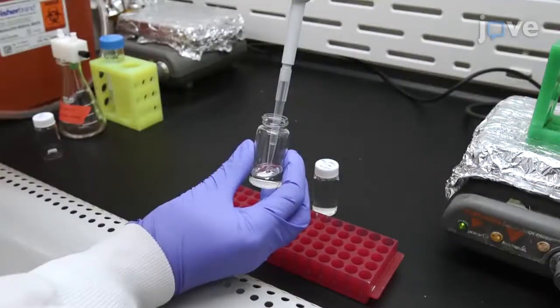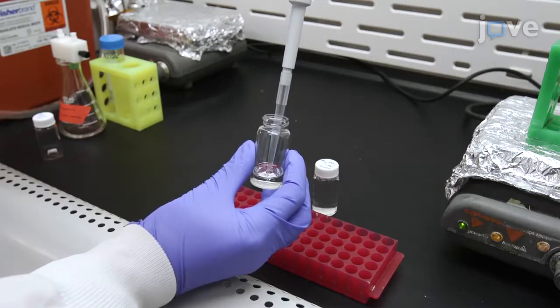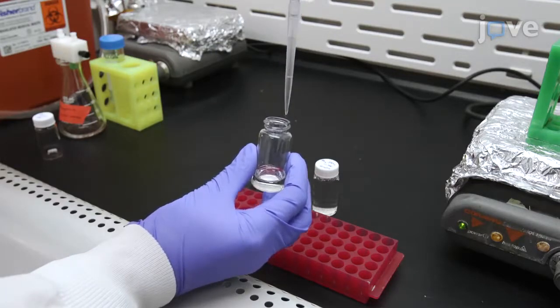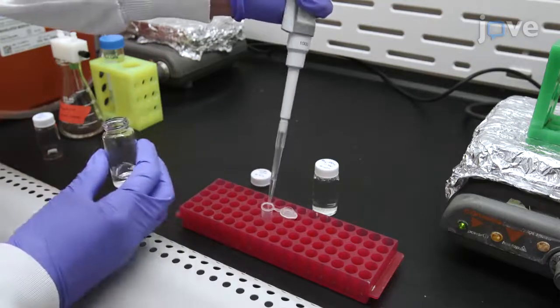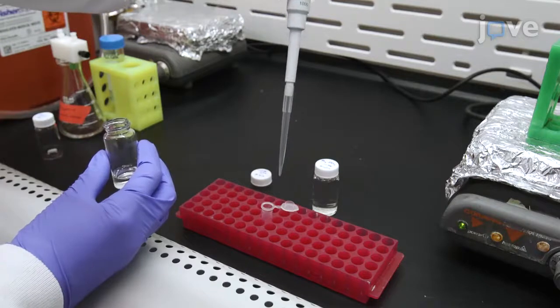Next, to begin preparing the solvent input stream, pipette 0.25 milliliters of a 10-milligrams-per-milliliter solution of vitamin E in stabilizer-free tetrahydrofuran into a 1.5-milliliter microcentrifuge tube.